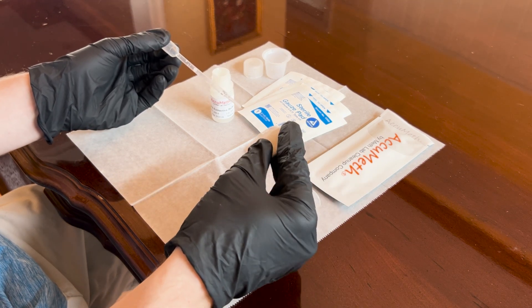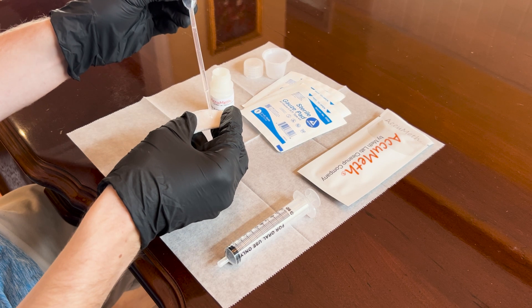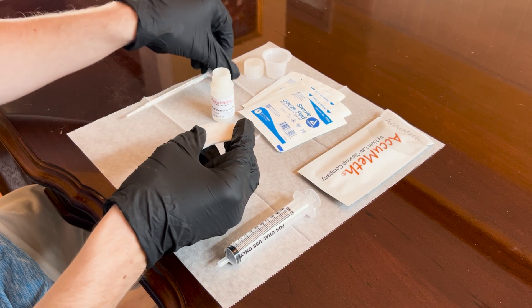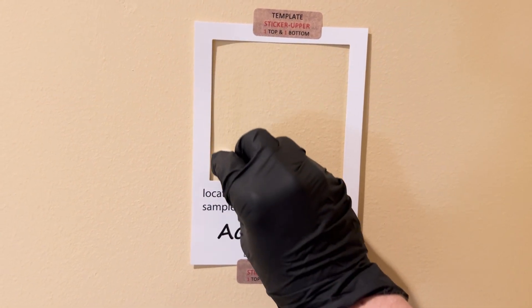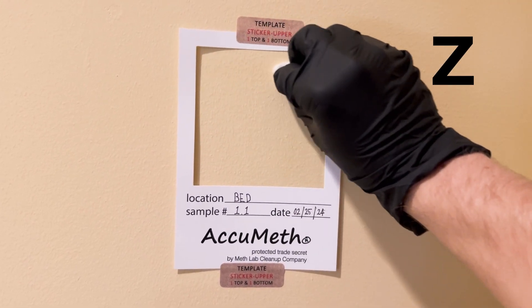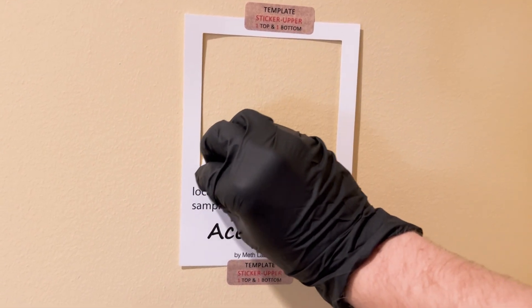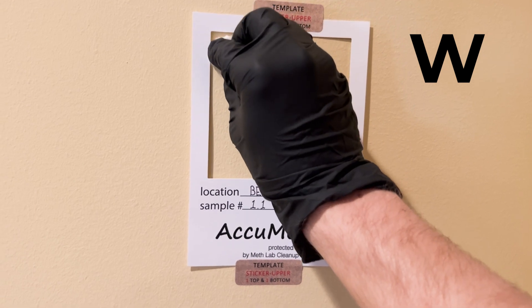Fold the gauze wipe in half and carefully add 10 drops of buffer from the pipette onto the folded gauze wipe. Moisten the folded gauze wipe evenly throughout. Now our gauze wipe is ready to take the sample. Put down the pipette and go to one of your posted sample templates. We are going to wipe the test surface within the template in a tight zigzag WZW fashion — first moving up and down in tight columns in a W fashion, and for the second pass, moving horizontally in rows in a Z style. For the last pass, turn the gauze wipe over and again move in an up-and-down W fashion.